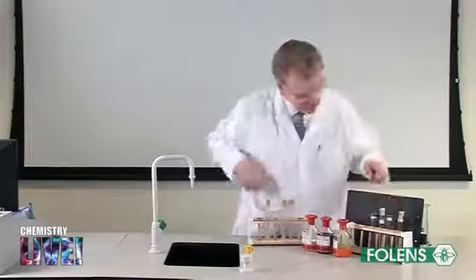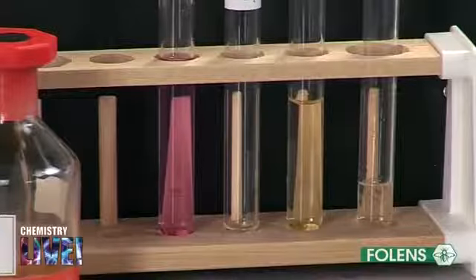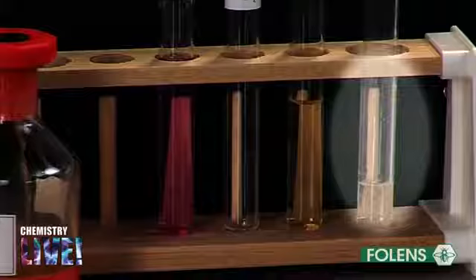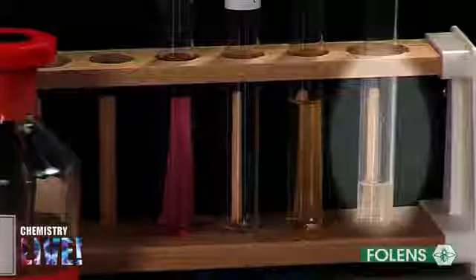Note that the yellow colour disappears. The very reactive carbon-carbon triple bond reacts readily with the bromine. You are not required to know the equation of the reaction or the names of the products for this course.